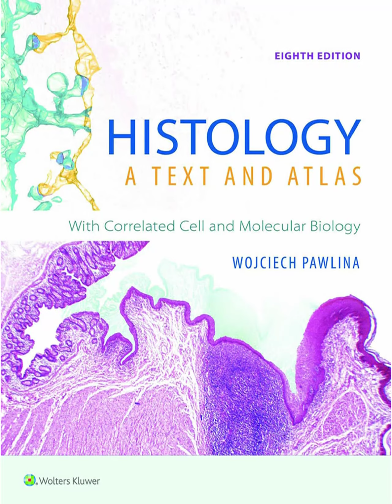Exactly. After fixation, the tissue is carefully washed and then dehydrated. Imagine slowly drawing all the water out, maybe like with a delicate sponge, using increasingly strong alcohol solutions, right up to 100% alcohol. Okay, step by step. Then comes a step called clearing. We use organic solvents, something like xylene or toluol. These solvents replace the alcohol and prepare the tissue to be infiltrated with warm, melted paraffin wax. Ah, paraffin wax. Like a candle. Sort of, yes. Once this wax cools and hardens, it creates a solid block with the tissue embedded right inside, nice and firm. Got it. Ready for slicing.